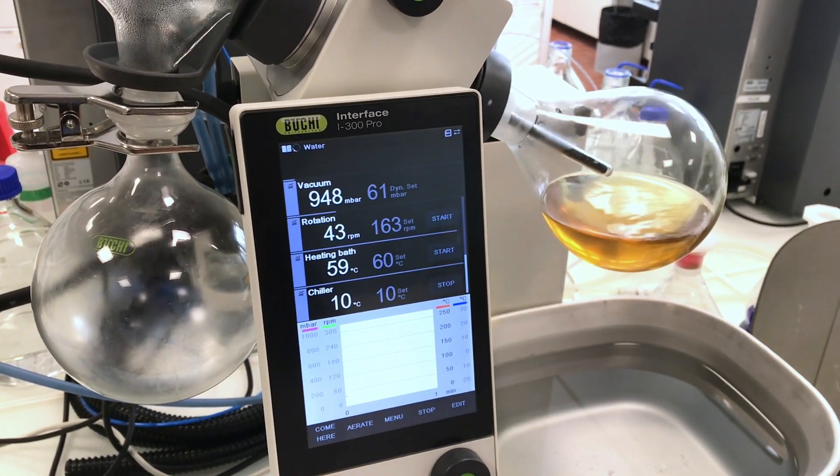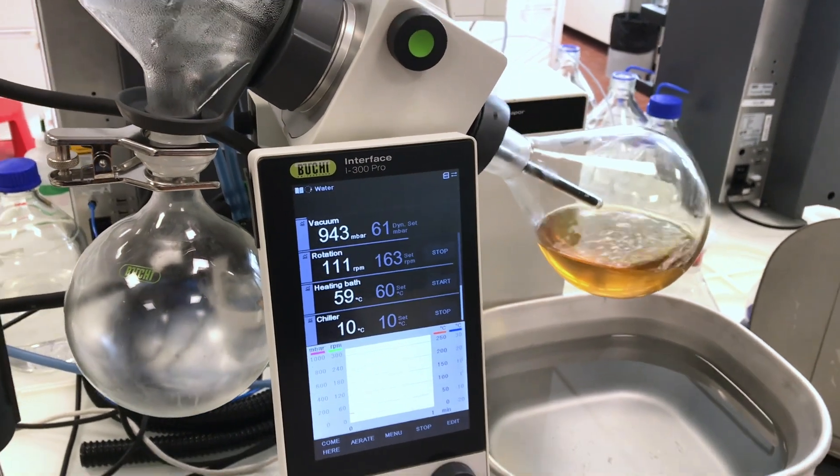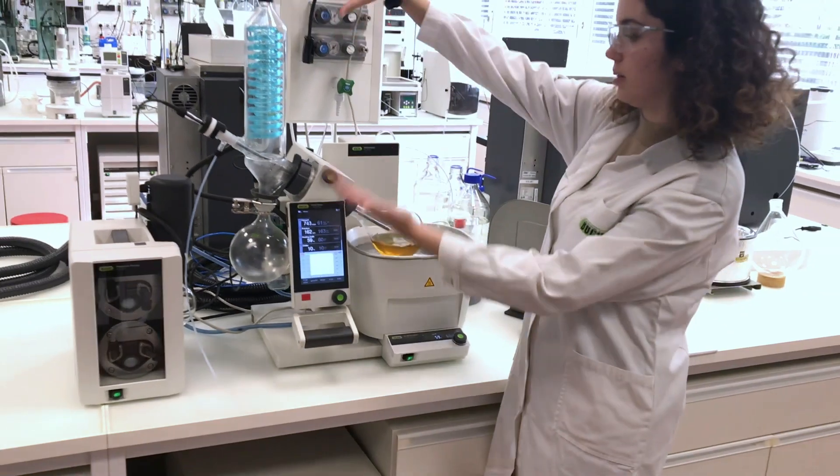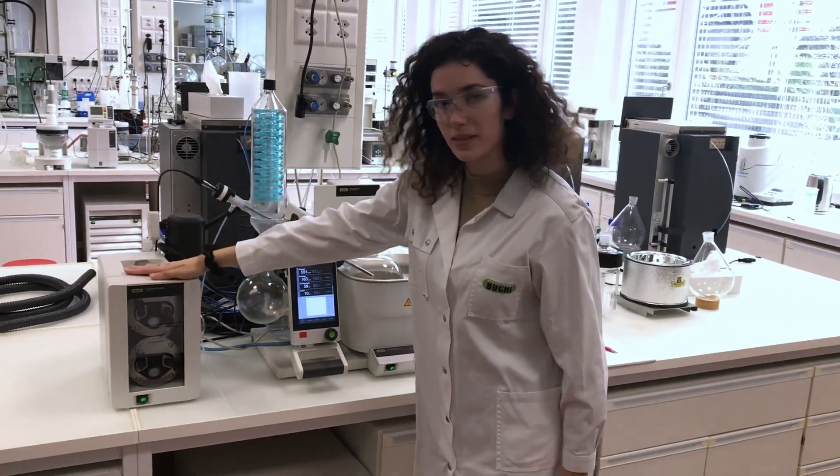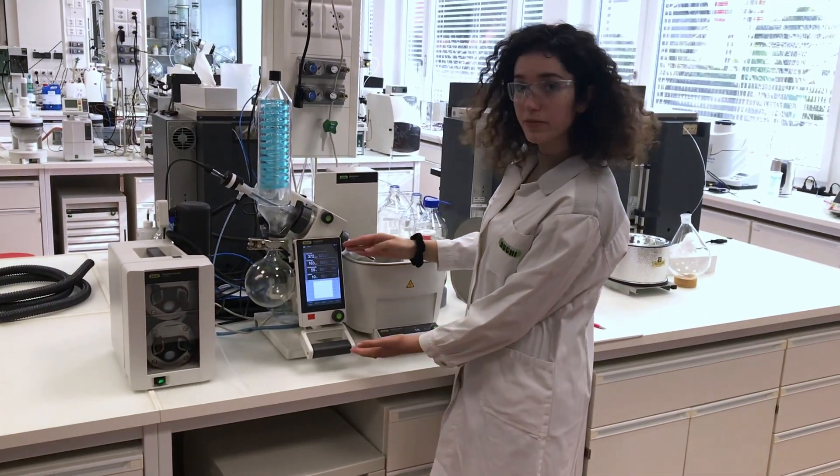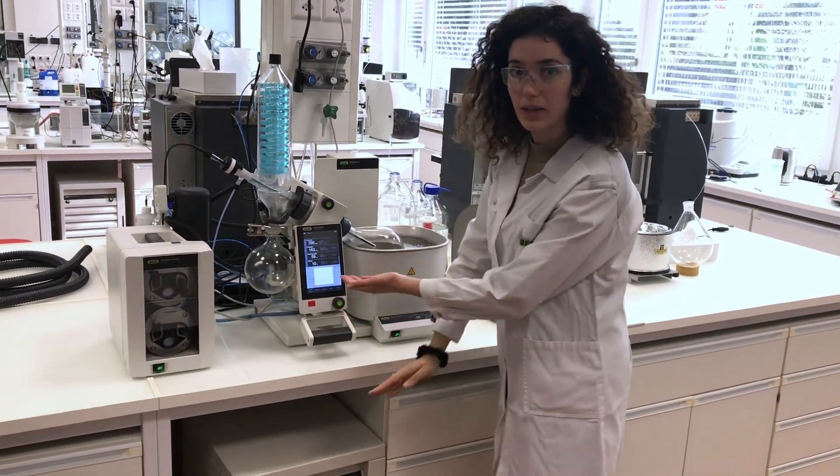So now we're going to go a little bit further and you can see we have the rotavapor here. We also have the pump that started pumping and the chiller down there, and because the interface is connected to all three of them, the pressure is set automatically.